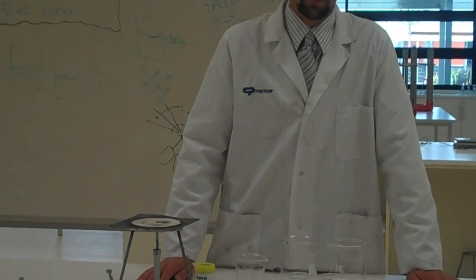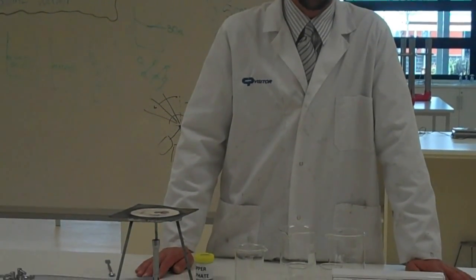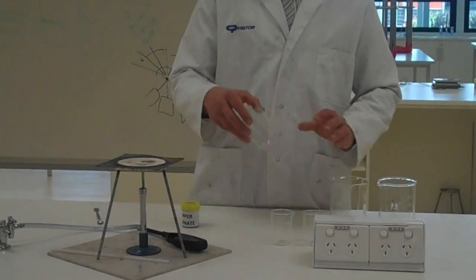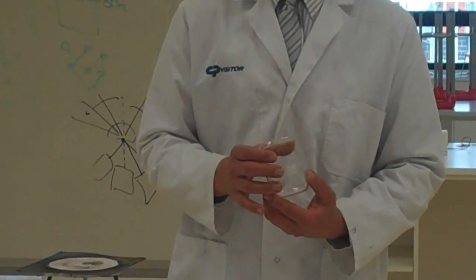We're doing the cooling rates and crystal growth experiment. I'll show you what's involved. First of all, we need to quarter fill the beaker with water.